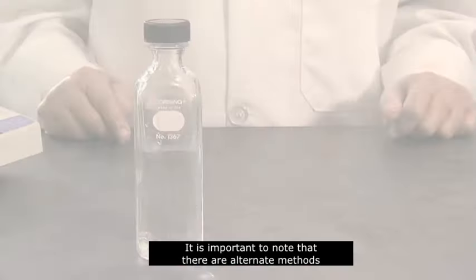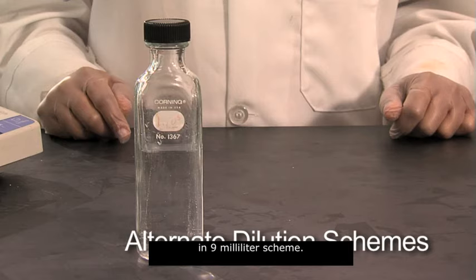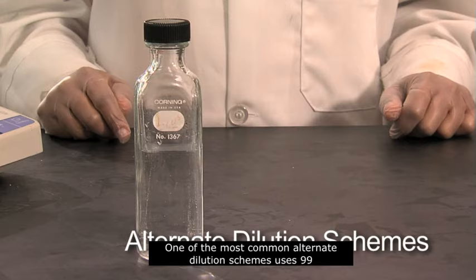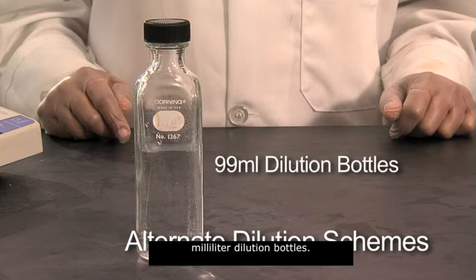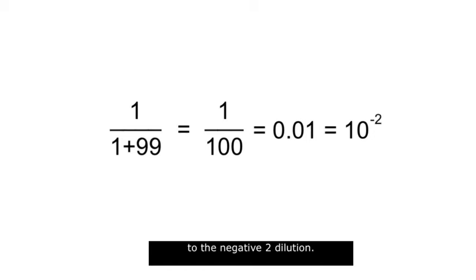It's important to note that there are alternate methods for performing a serial dilution other than the 1 milliliter in 9 milliliter scheme. One of the most common alternate dilution schemes uses 99 milliliter dilution bottles. In this case, 1 milliliter in 99 milliliters is a 1 to 100 or 10 to the negative 2 dilution.